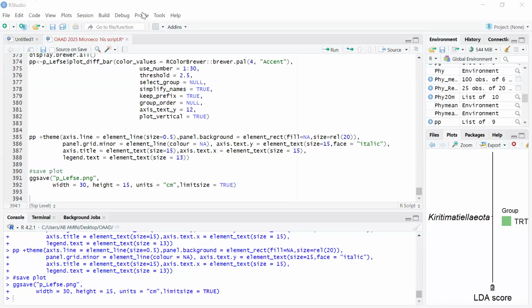If I understood the question correctly, you wanted to know after the sequences are obtained, how the taxa is obtained. Am I correct? Exactly. Okay. Those are usually done at the upstream analysis, and in my own case, it was done by the sequencing laboratory using QIIME. That's why I say it has to be converted to OTU. That is QIIME 1 or QIIME 2.